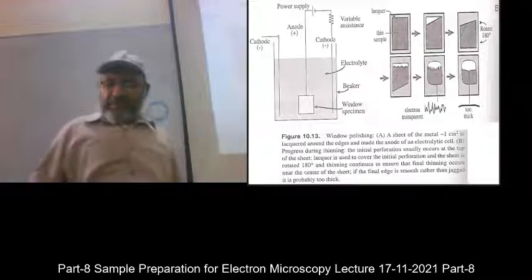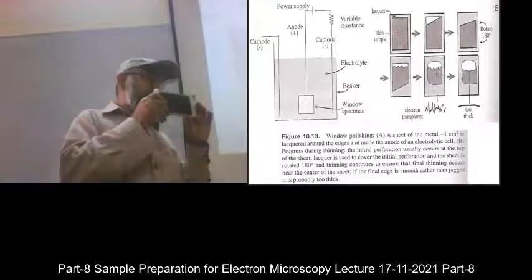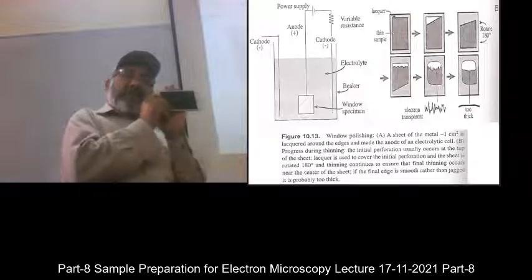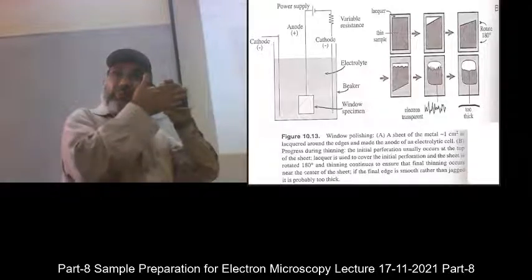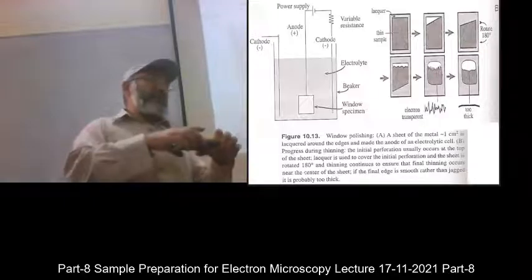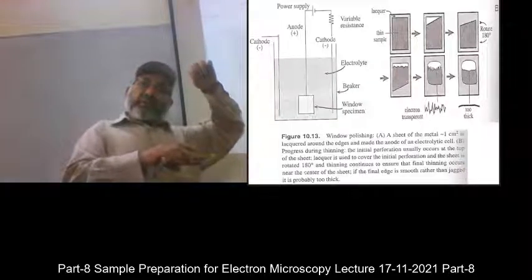A capacitor is a wheel, a circular disc, right? This side has an electrode and this side has an electrode. But how do you make electrodes? You put that disc in the sputter coater.